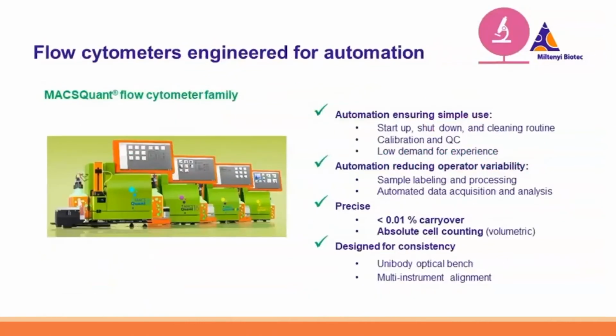Now, when it comes to flow cytometer instruments, there are some common challenges that come with maintenance and complicated use, operator variability, and sometimes sensitivity and consistency. In general, to solve such problems, a high degree of automation can help to reduce the human error.